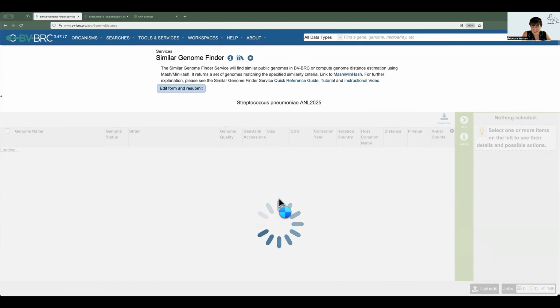And then the next one's going to take even longer because I'm going to repeat it and ask for 500. You may ask, why are you not asking for 500 now? Why do we have to sit through this twice? Well, this will be a nice, neat packet, these 100 genomes to submit to the bacterial genome tree. With the other ones, we're going to be doing some filtering on specific phenotypes of these genomes.